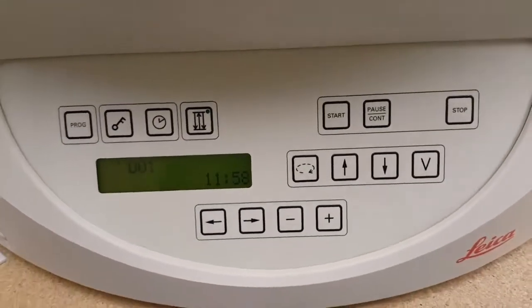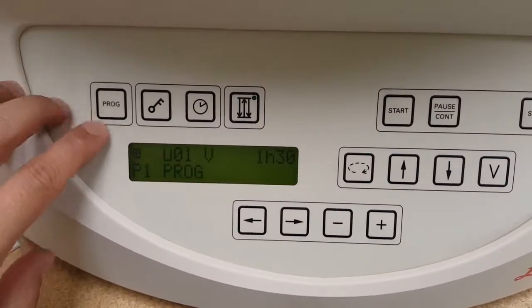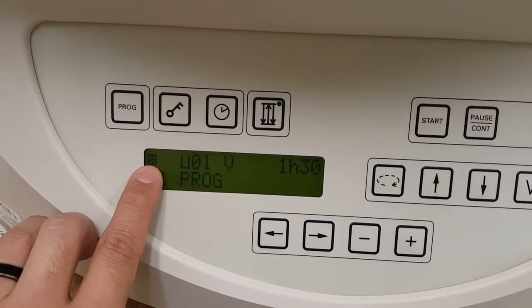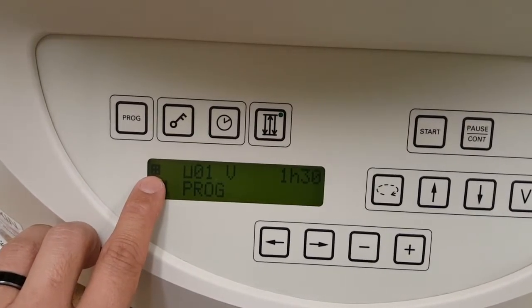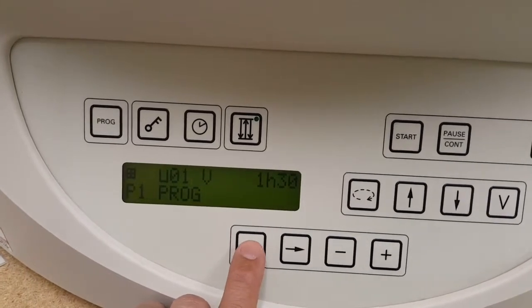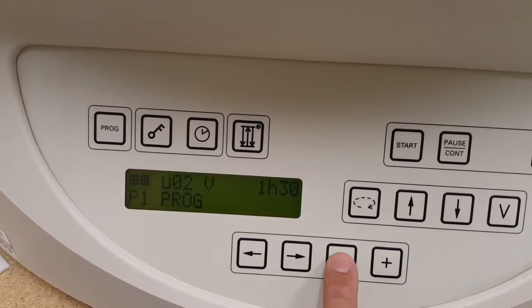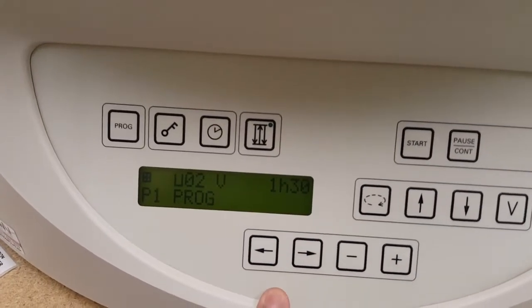In order to program your first program, you'll come over here and hit the program button and you'll come into programming mode. This right here with the four little quadrants — that is how many baskets you have. That is one basket. To increase that, you would need the second basket kit. We're going to leave it in one basket programming.